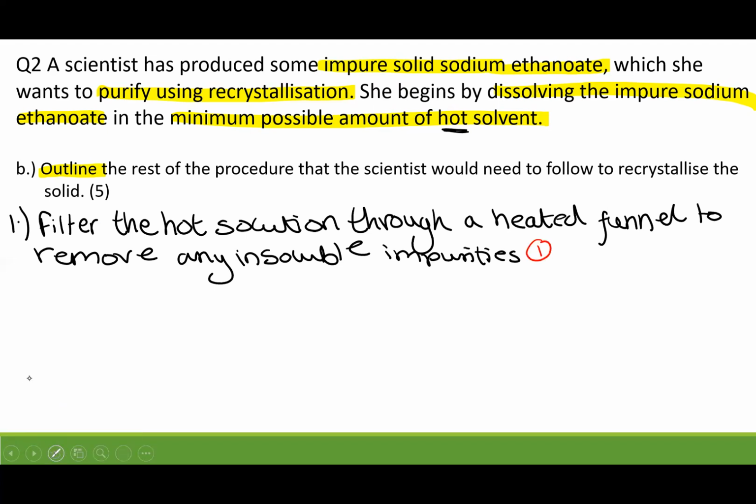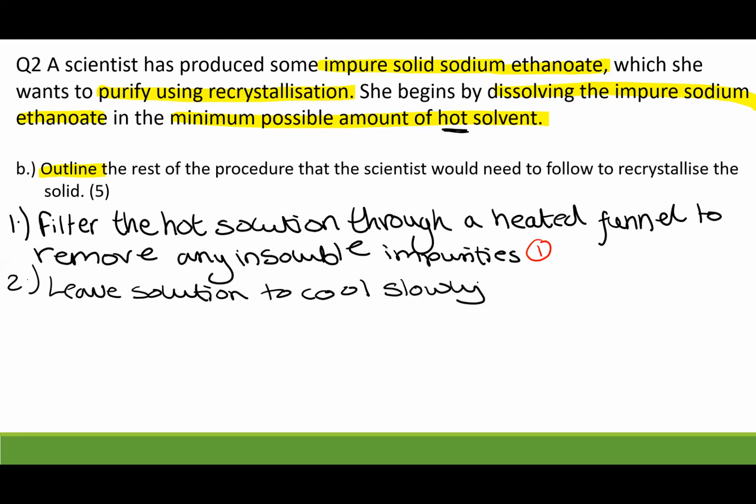Second point: you're then going to leave the solution to cool. I'm going to add cool slowly because that's really important. Leave the solution to cool slowly until crystals have formed. Again, that will get you the second mark.